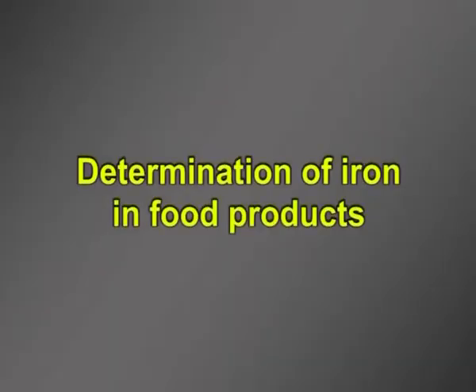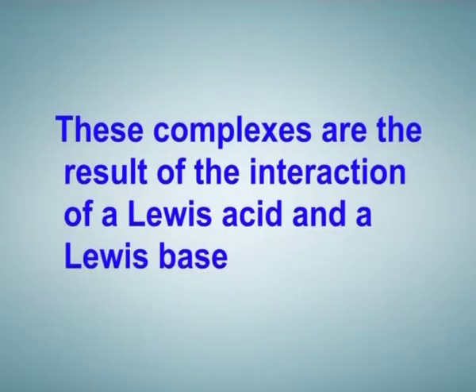Next application, determination of iron in food products. Some metal ions in very low concentration show a strong color by the formation of a complex with a ligand. These complexes are the result of the interactions of a Lewis acid and a Lewis base.